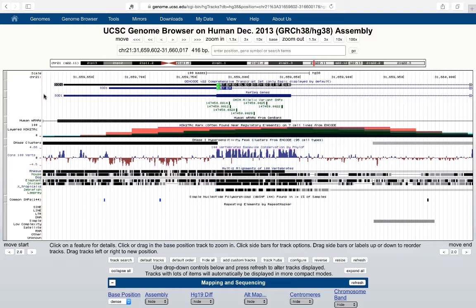The difference between them is that there's a truncation in exon 1. Now I'd like to talk more about the other default annotation tracks that are on when you go to the browser for the first time.